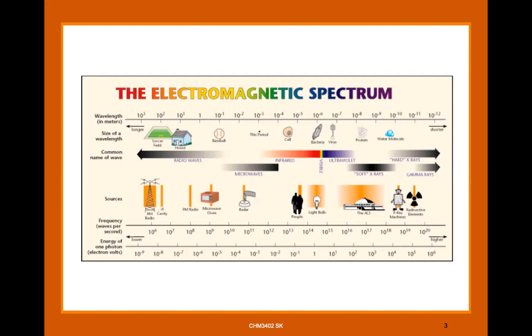The compounds that are active in fluorescence are even fewer. The number is less than those that are active in UV and visible. So of course that means the option to do fluorescence is less than for those compounds that are active in the visible and UV region, but it is very selective.